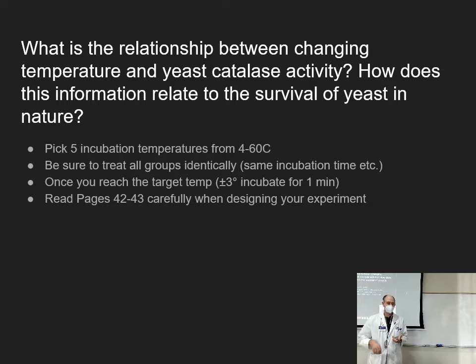So if you remember, molecules are in motion. So when you have a test tube with peroxide in it and yeast in it, that peroxide is in motion as long as you're not at absolute zero. And it's hitting the yeast. It's probably actually popping some of the membranes of the yeast and getting into the yeast because it does oxidize things. And then it's interacting with the yeast catalase. And then it liberates oxygen when that happens, and that's how we measure a change in pressure.